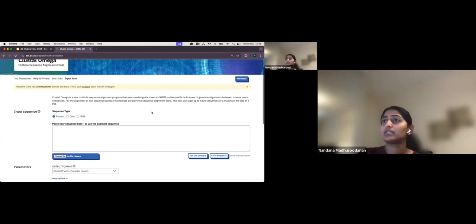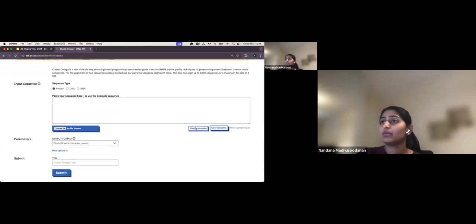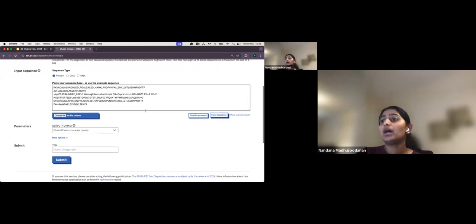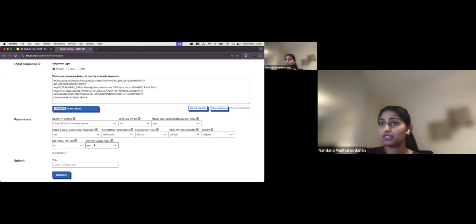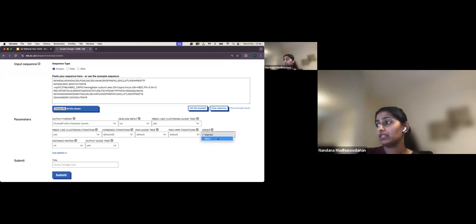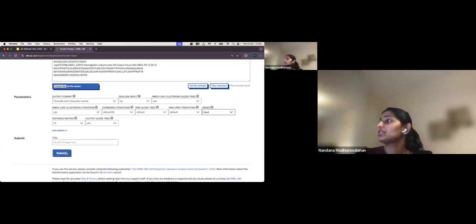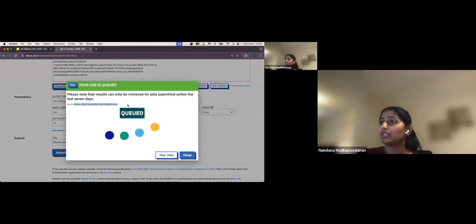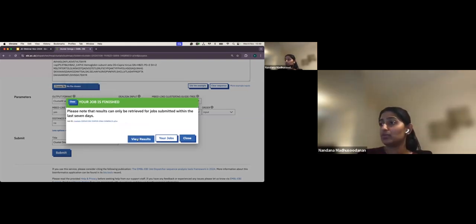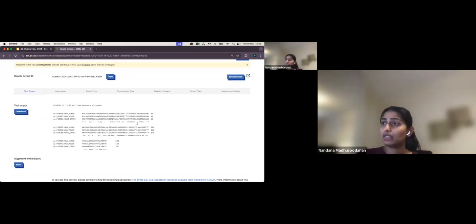Clustal Omega is a multiple sequence alignment tool, as many of you know. I'm selecting protein sequence type and using the example sequence. These are the available parameters. Suppose I want to change the order of the alignment — if I want the resultant alignment in the same order as the input — I can change it to 'input'. Now I'll submit it. You can see the job ID, it's queued and then running, and you'll get the results shortly.